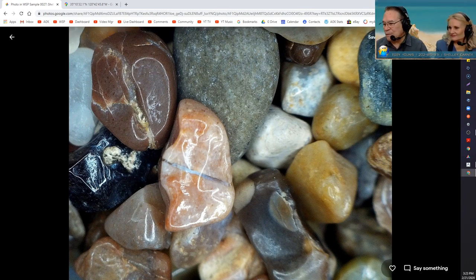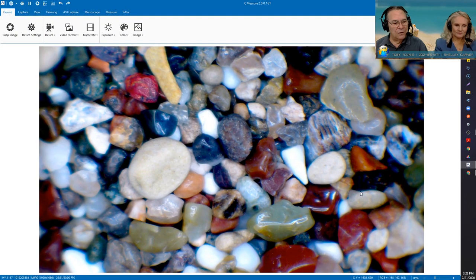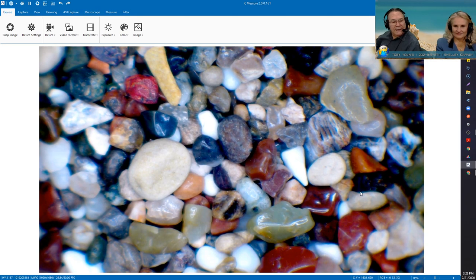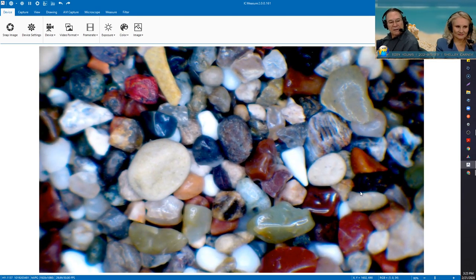Let's switch over to the microscopes and take a look at the sample under the scope. The light on the scope creates a little bit more color than you'll see in the sample itself. And I can't zoom in too far, but I picked this one because this white object over here has those telltale holes of a foram, as does this right here. That one's more polished.